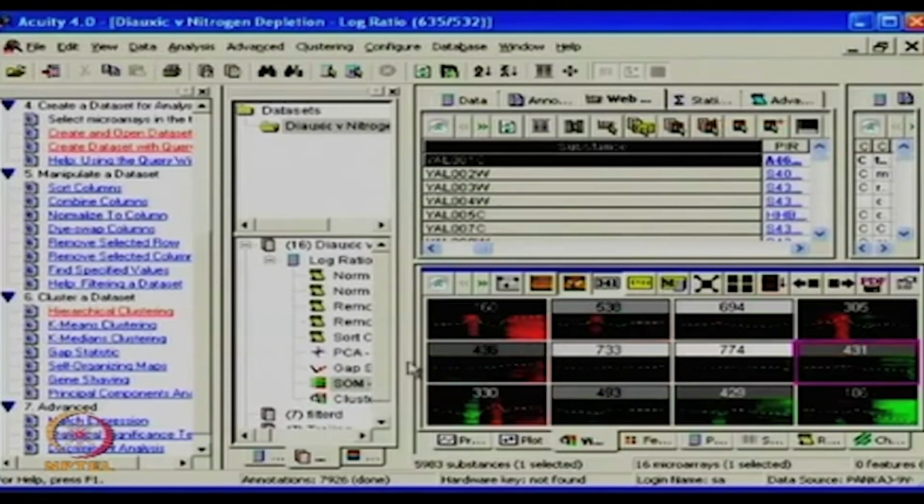Because I have given 4x3, I will be able to see 4x3, so 4 columns and 3 rows. Independently that is being divided, so one can have any numbers. The idea comes from the hierarchical, but as you see here the clustering gives an immediate response that, okay, this was very low in these ones, again it went down and you are able to see it again up. And different time codes have different expression. Based on the behaviors you can see that, okay, this is being grouped up with.